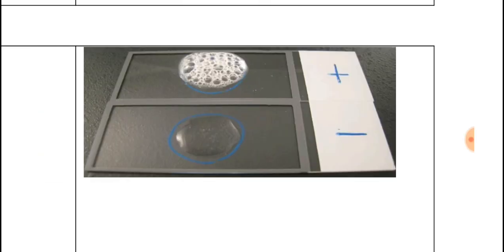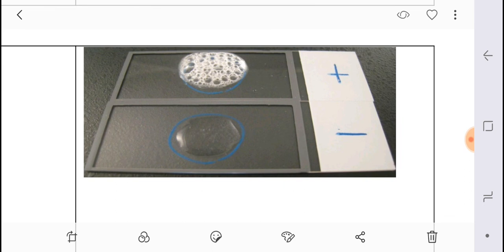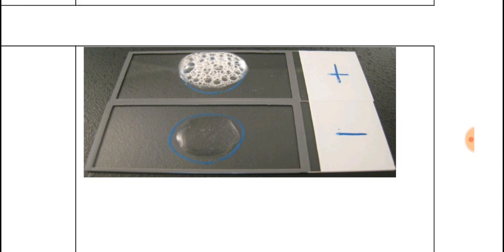Then this particular test is the catalase test. Okay, and you know the catalase test is performed with 3% hydrogen peroxide. When you put the colonies of this organism onto 3% H2O2, bubbles come because of the release of nascent oxygen.